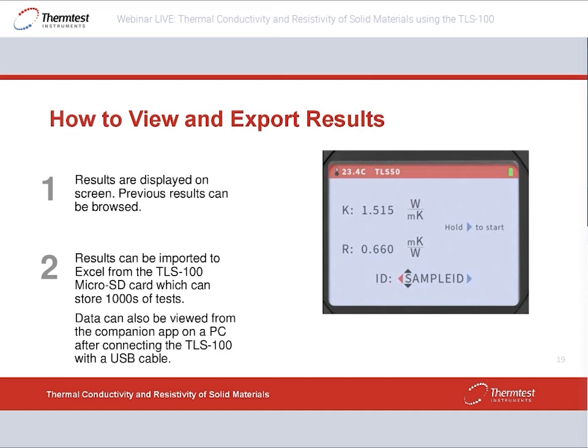So this is the 50 millimeter probe, and here's thermoconductivity, watts per meter Kelvin, and thermal resistance, which is the inverse, meter Kelvin per watts. And you name your sample down here, and it's a one button to start. Once you have a bunch of results, you can easily export it to Excel directly from the TLS 100, where everything is stored on a micro SD card, so you can store thousands of tests on it. So usually a good idea to every now and then do a transfer of your results over to Excel to be able to deal with them more easily.